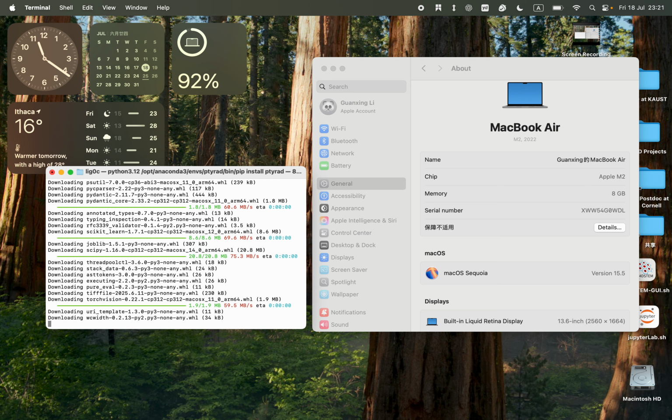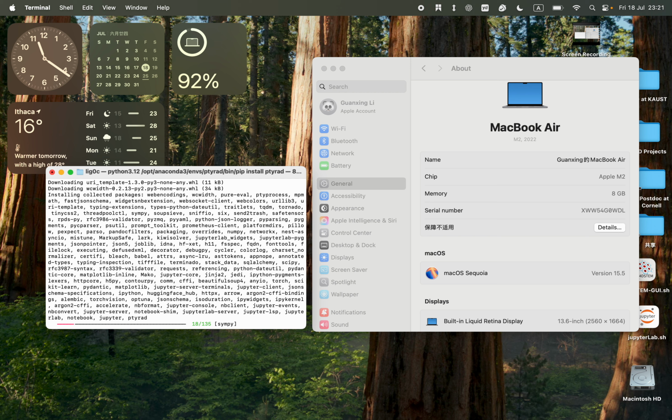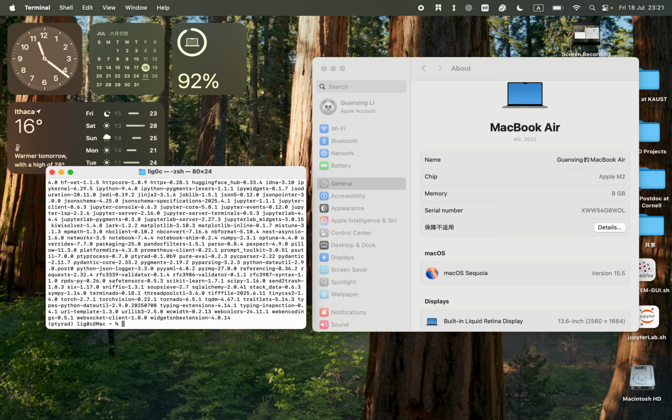As long as you have correctly updated your pip, make sure it's in the modern version, and also you have correctly purged or removed the cache of your pip, then it should all solve to the correct version. And you can see that it's actually installing pretty fast on the Unix system like Linux or a MacBook, which is pretty cool.